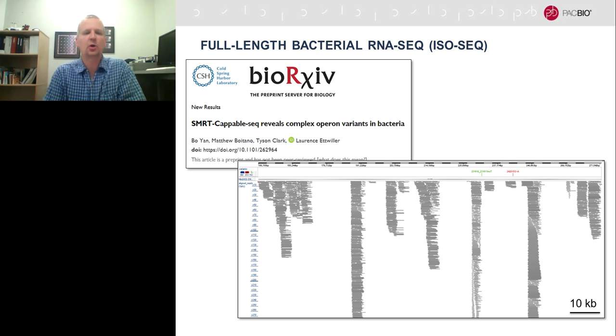Now, moving from the genome to the transcriptome, we've had a very pleasant collaboration with New England Biolabs, Laurence Ettwiller, about adapting our Iso-Seq full-length RNA-seq protocol to bacterial RNA. Of course, they're not polyadenylated. This particular preprint, which is on bioRxiv and is now in press in Nature Communications, and I understand will be published this week sometime, details how we can adapt the protocol to bacterial transcripts.